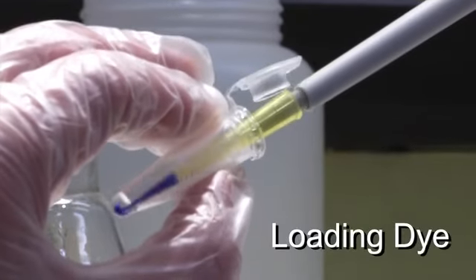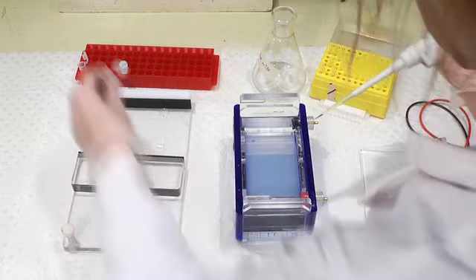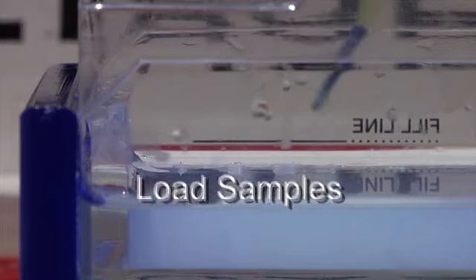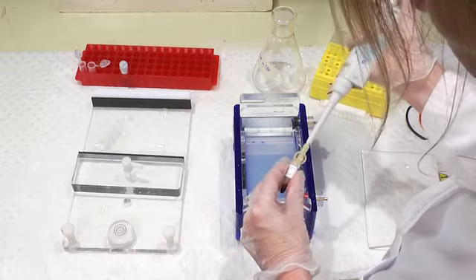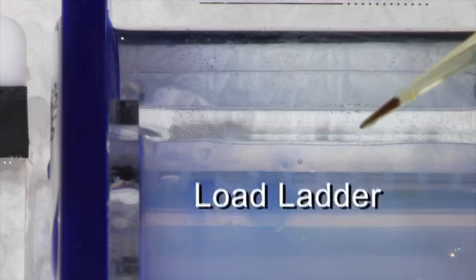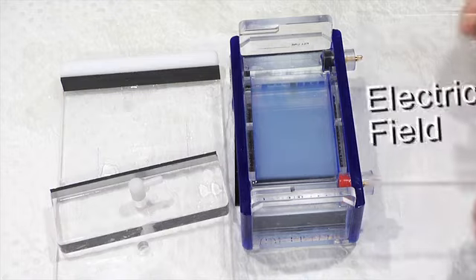After we take out the well combs, each sample is mixed with a loading dye. We then load our plasmid sample and insert sample into two different wells of the gel. We also load a standard ladder containing DNA fragments of known sizes, and then finally apply the electric field.